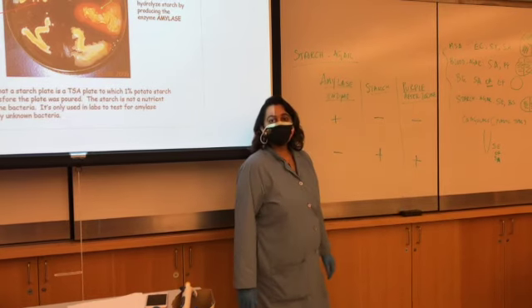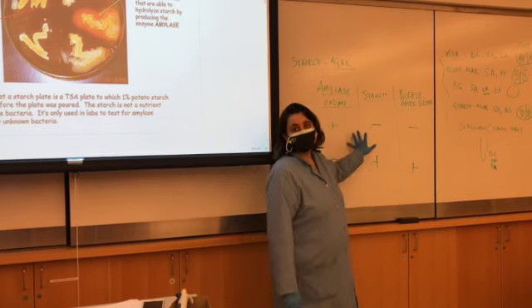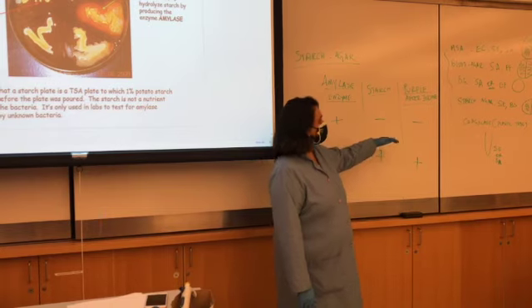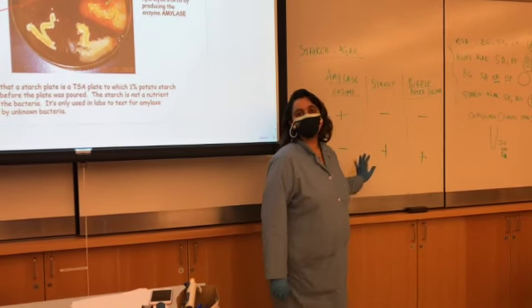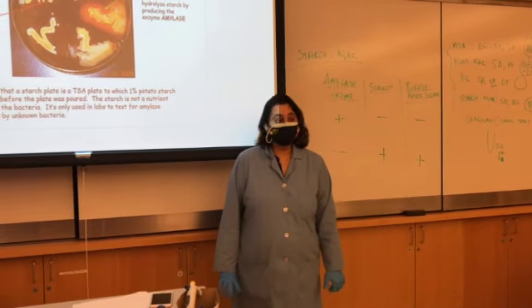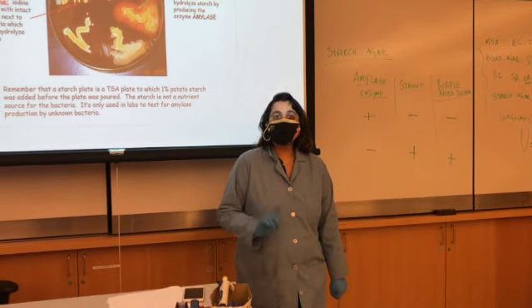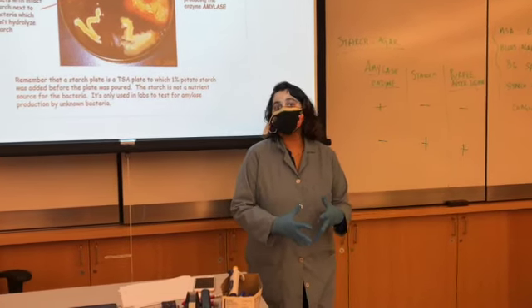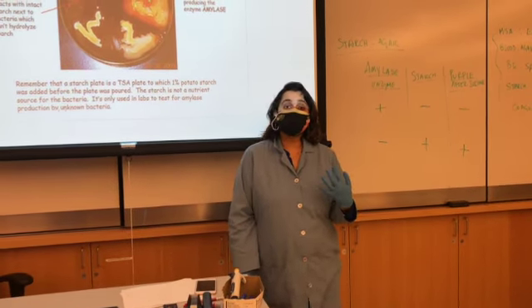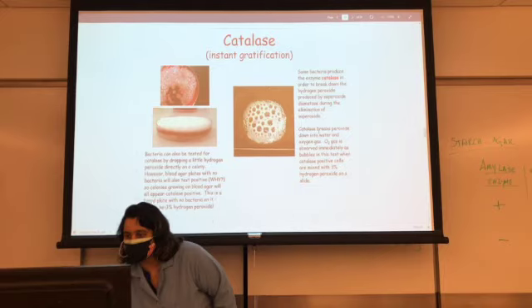So this table is important for your Canvas quiz. I will ask you questions based on this. Okay? So a specific bacteria, if it has amylase, what happens to the starch, and whether you get purple color or not, those kind of questions. Okay? Alright, so that's about your gram-positive diagnostic test. Last but not the least, there is one very easy test that can be done on the day itself. You don't need to wait for the bacteria to grow, and that test is known as catalase test. Okay? I'll show you guys the picture of the catalase test.